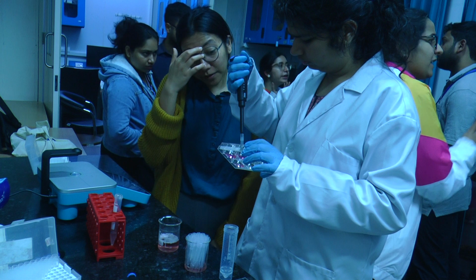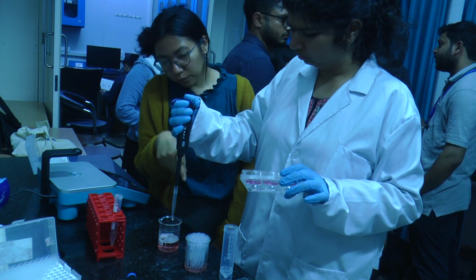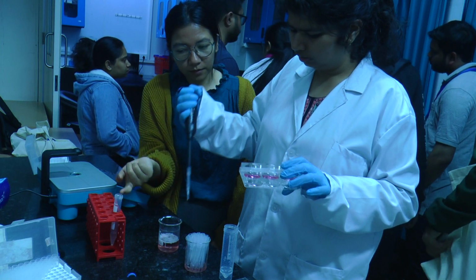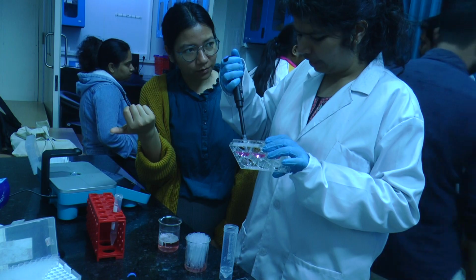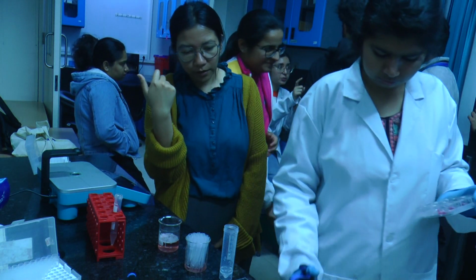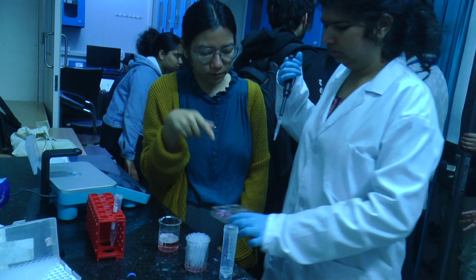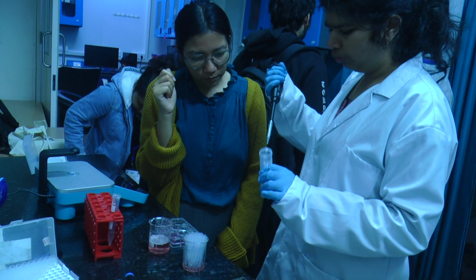So then you discard this, then you are adding the buffer solution, right? And then you are extracting, actually taking it out again. If I don't change anything, then I have protein. What does this buffer do? If I'm giving a protein sugar, I get a large number. Maybe I'll share my paper with you.